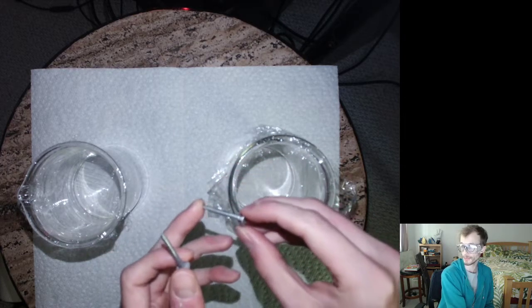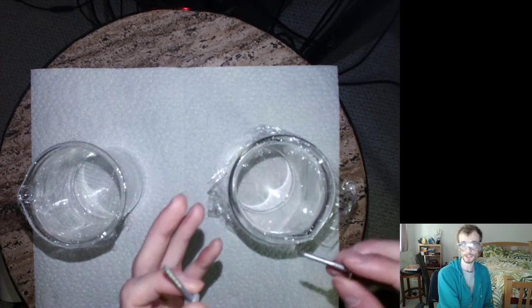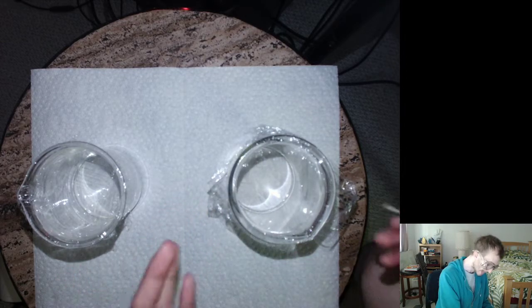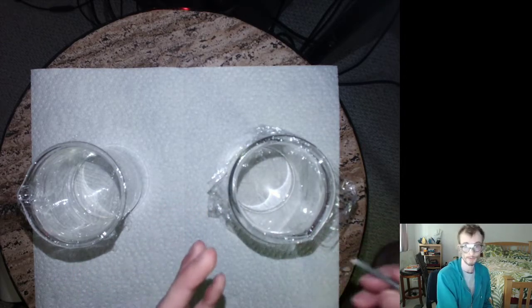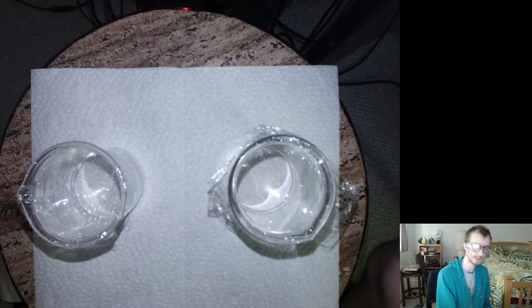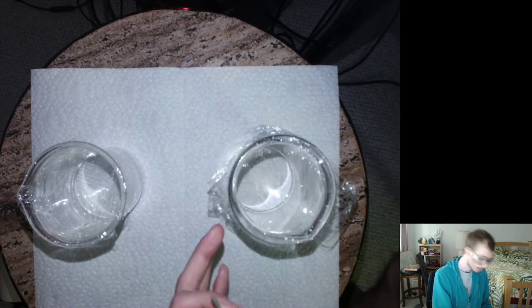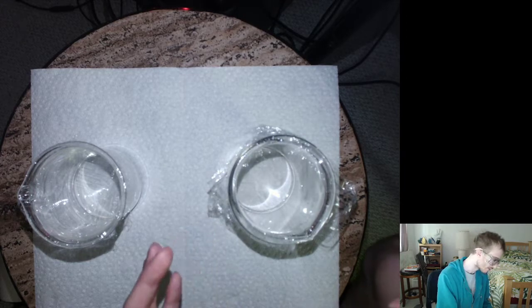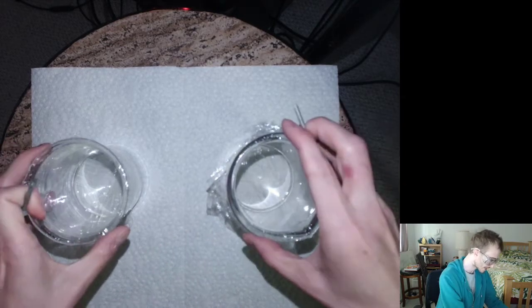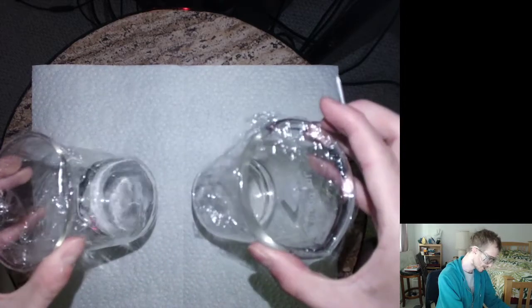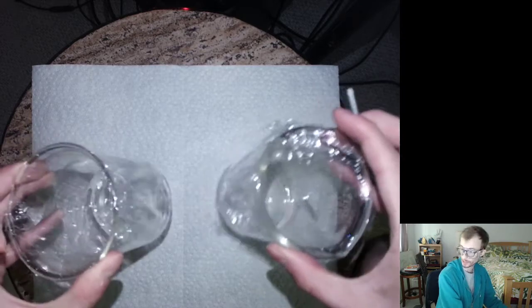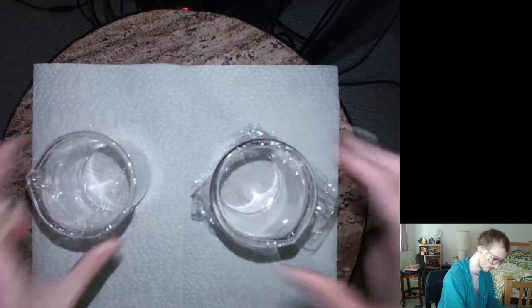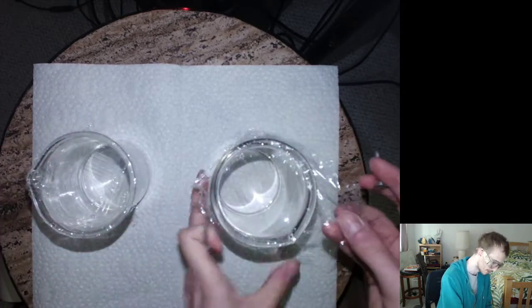Now one of the properties that makes acids special is that they will react with some metals, essentially dissolving them and giving off H2 gas. So I have our two samples. One of these is sodium hydroxide, the other one is HCl, so one is an acid and one is a base.